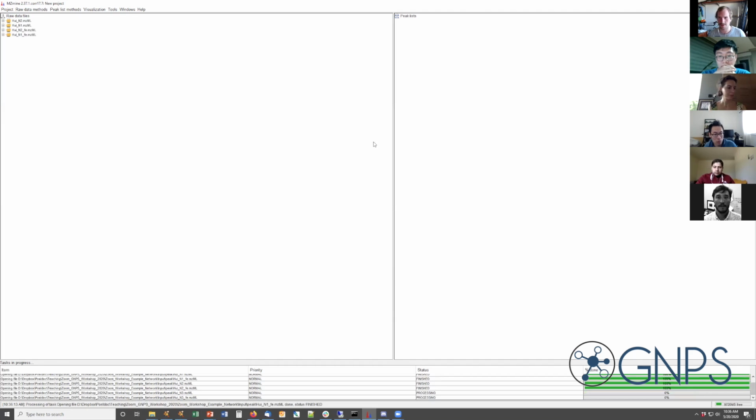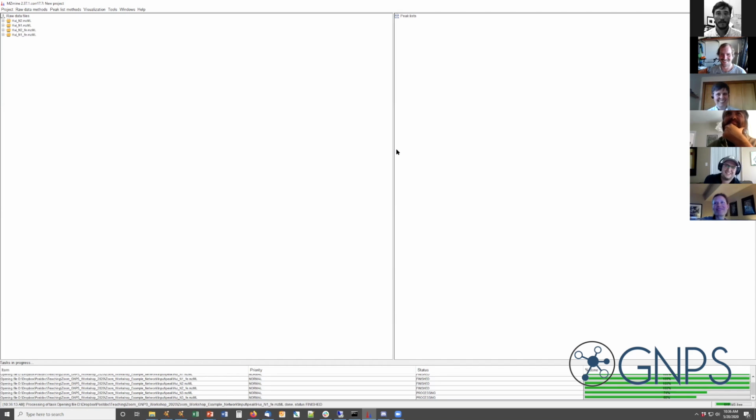While this is running, are there other questions, or does somebody want to share something they found? No, nobody found any molecules in the hands-on data? I didn't try. Come on, we picked such a nice example. I'm really curious what you found. It worked for me, but I don't want to spoil the fun for everyone else. No, come on, tell us.